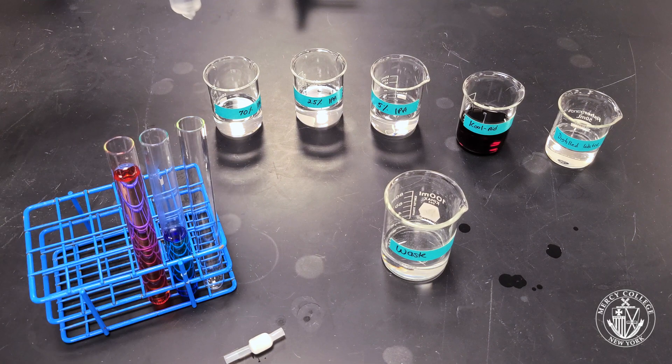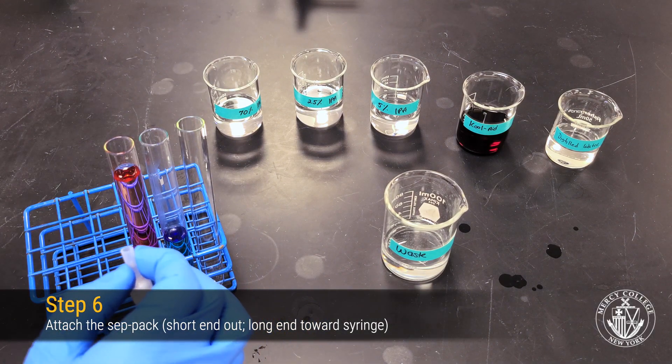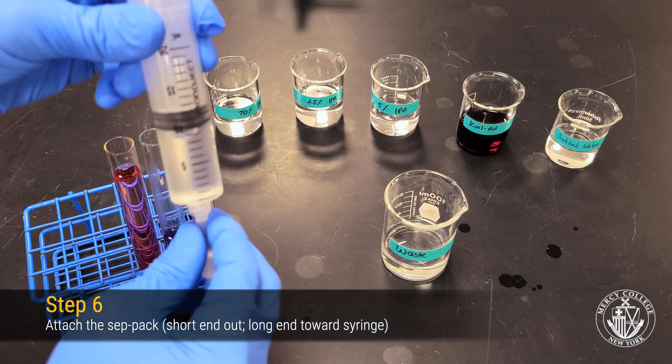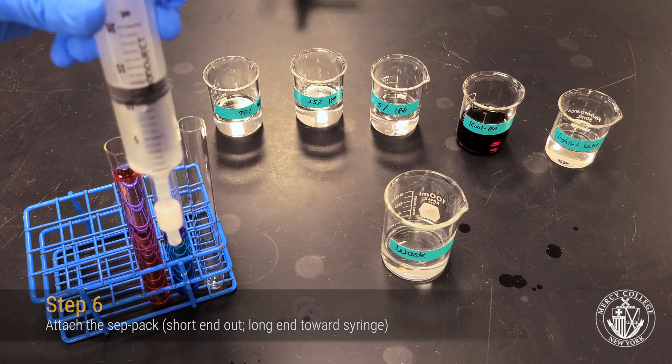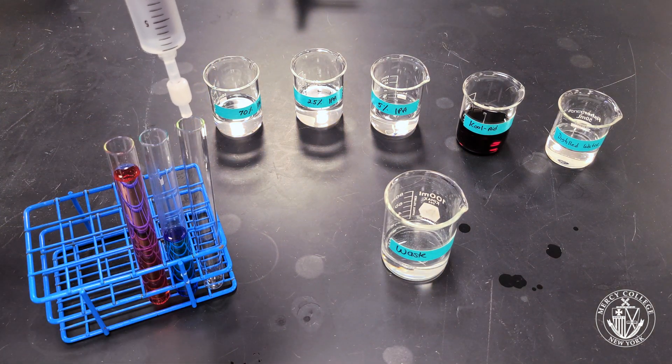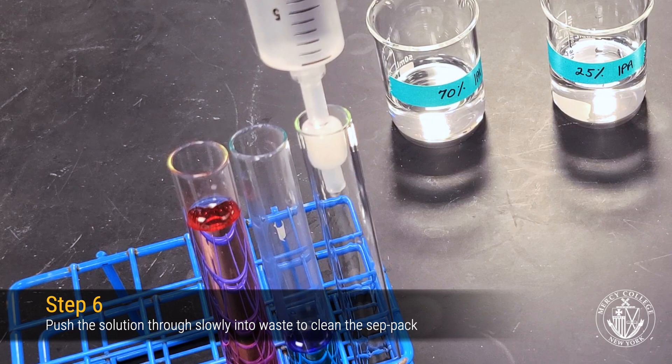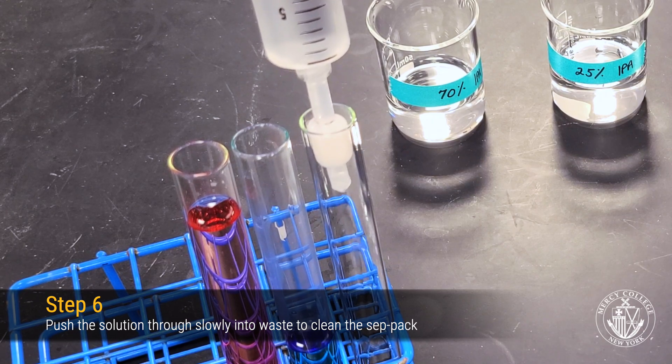Now reattach the CEPPAC column to your syringe and push the 70% IPA through into waste or into another test tube. If you've successfully removed both dyes from the column, the solution should come through clear.